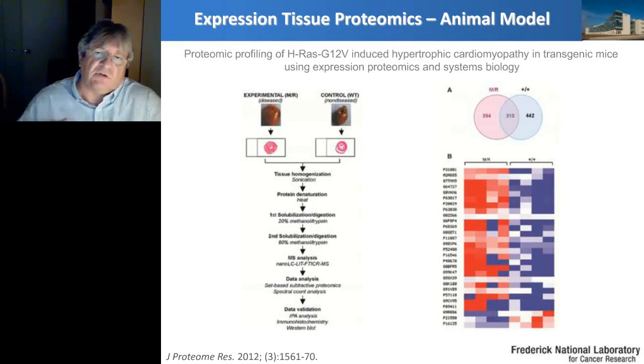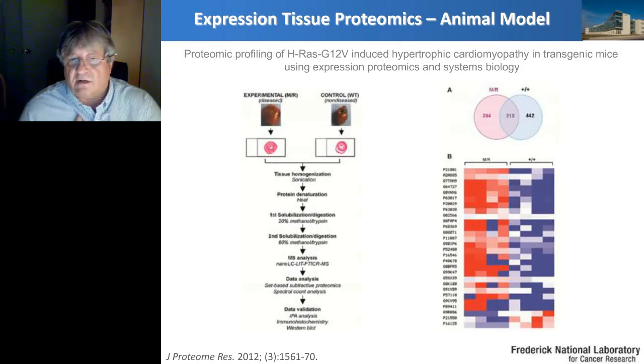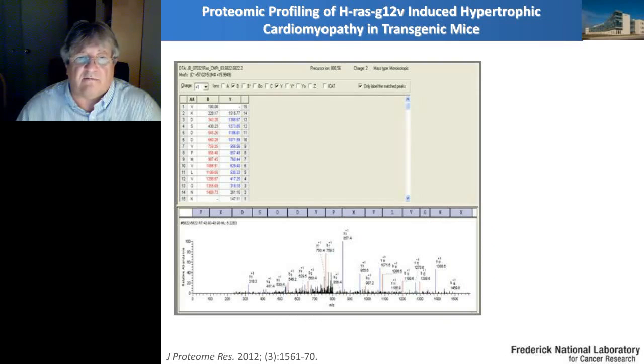So we have used spectral counting and intensity values for the cells. We have normal heart and hypertrophic heart, and we see here the mostly dysregulated genes. So that is a typical proteomic workflow. However, we wanted to go deeper and see what is really happening in that myocardium at the molecular level.